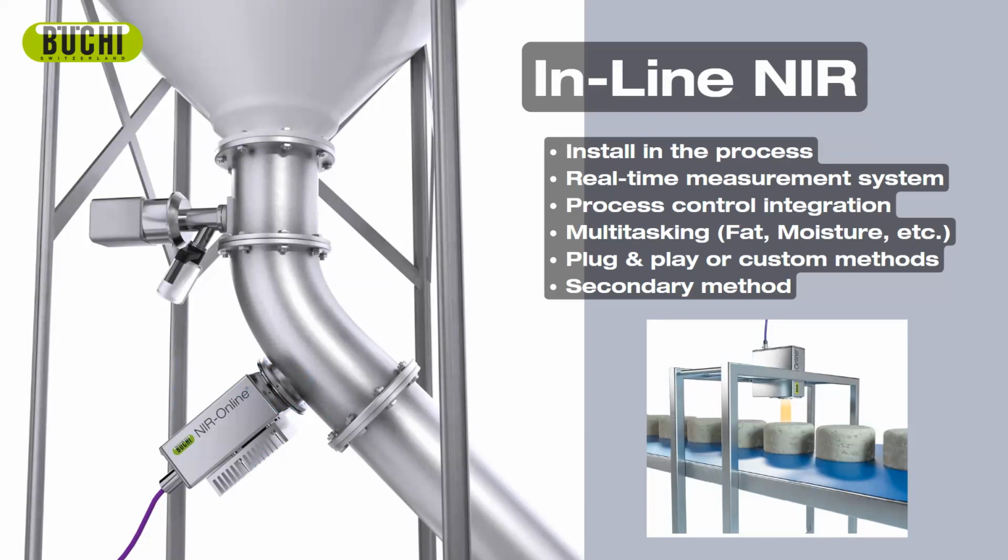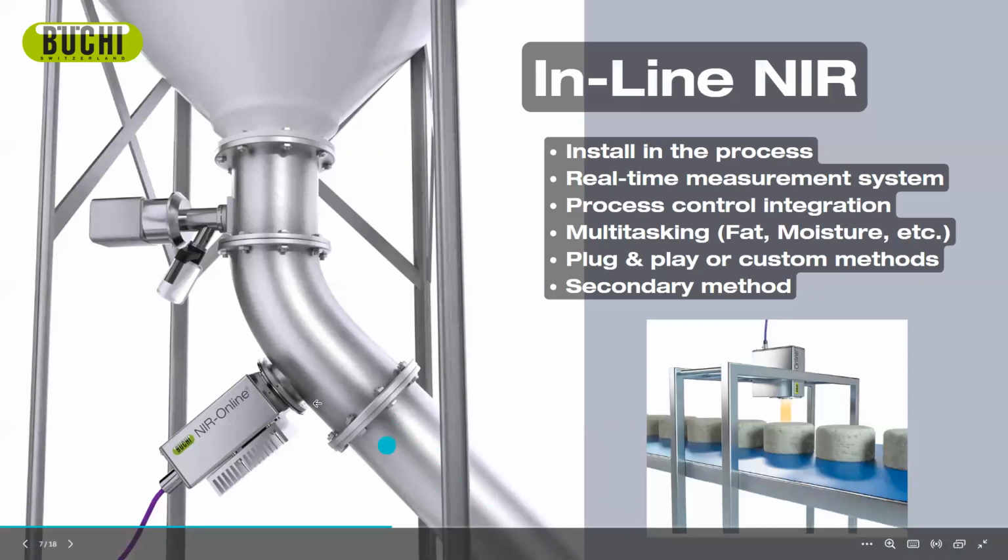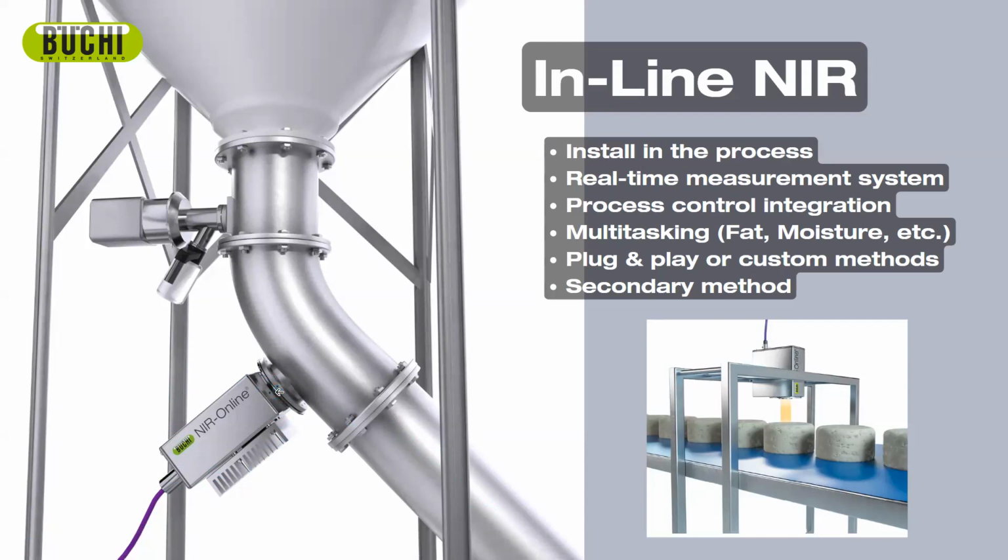On the left, we actually have a pipe which has product going through a chute down here. The sample will run over the analyzer that you see with the purple cable there. So there's a sapphire lens mounted into the pipe, and the light is going to hit the product and come back, and you're going to get the spectra, which is going to give you those results. So again, it's constantly moving product going over that sensor, and you see real time what's going on.